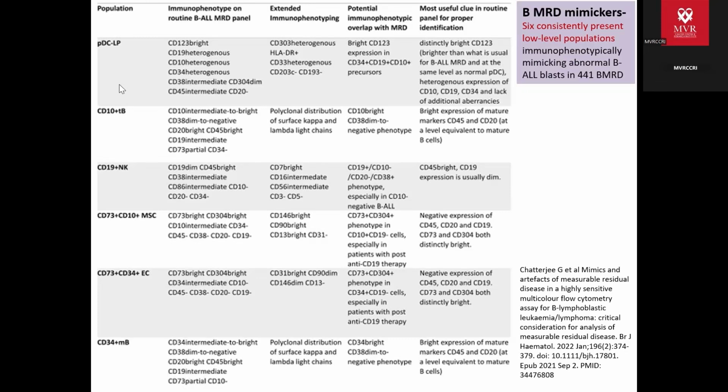Then there is RT quantitative PCR, where in case of AML, if it is BCR-ABL positive or PML-RARA, we just look for that fusion transcript in the analysis of MRD. So we see each test has its own threshold. Morphology up to 5%. MRD detection, if it is a 4-color, 1 lakh event, will not reach up to the threshold. If it is a 10-color flow, which is using 4 million, 6 million events, it will reach even the sensitivity used by an NGS of 10 raised to minus 6, which is supposed to be a very sensitive method for MRD detection.